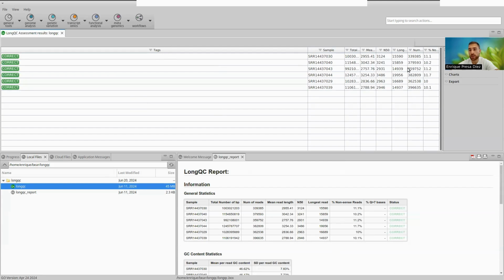And you have also some metrics that you can see here better. You can see that we have different metrics, and all of them have similar numbers, like they have homogeneous metrics. That's good. That means that there are no samples that have outliers or strange things. So it seems that our dataset is good.